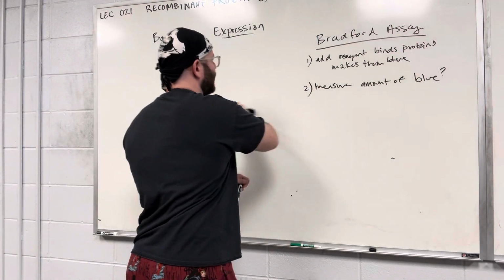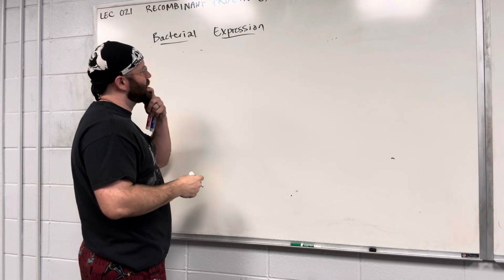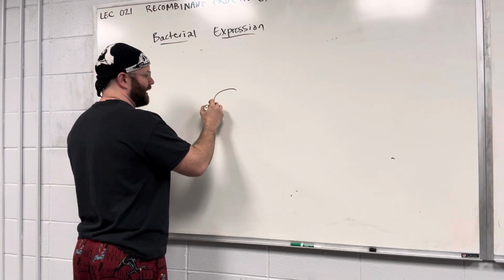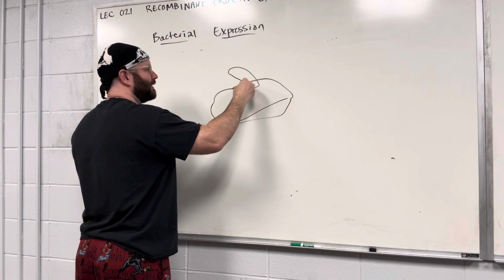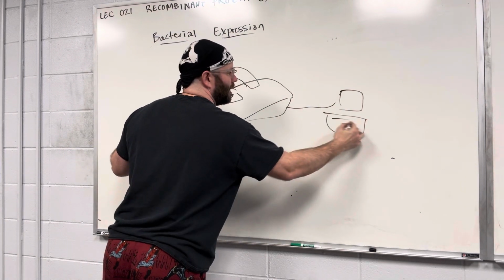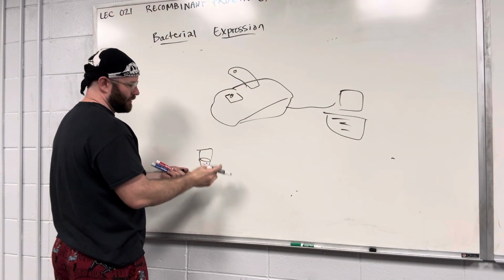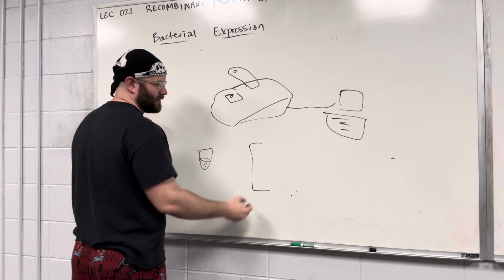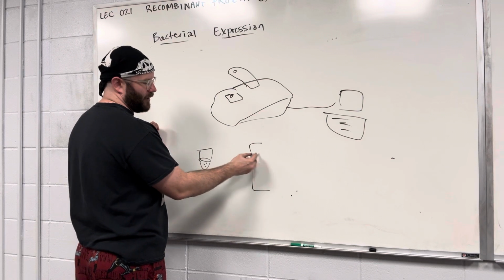Could you explain nanodrop? Nanodrop, okay, yeah, that's another yield calculation. There are pros and cons to each of these yield calculations. Nanodrop is kind of considered sloppy, but decent. So nanodrop is essentially just, it kind of looks like this, and there's a pedestal, and it's connected to a computer. You'll take a drop of your unknown yield protein, put the drop on this thing, close it, and just press a button, and it'll spit out a series of numbers. It's essentially a mini spectrophotometer that takes a bunch of readings.